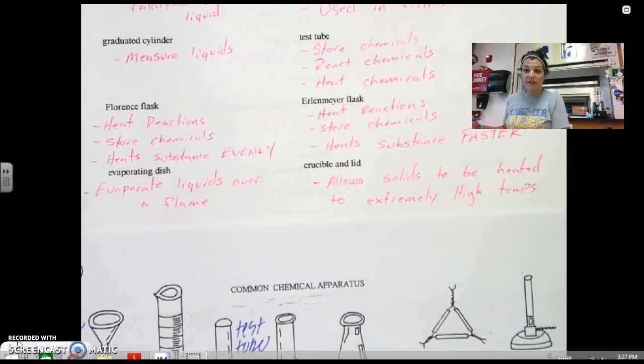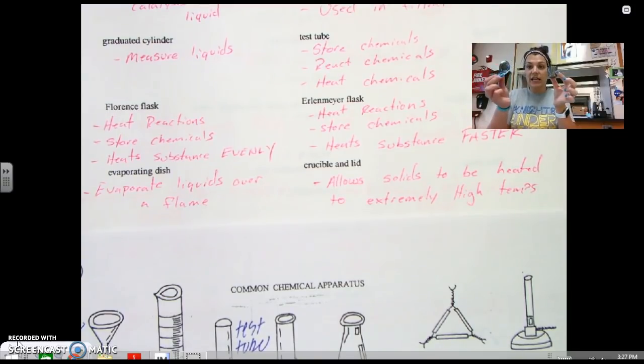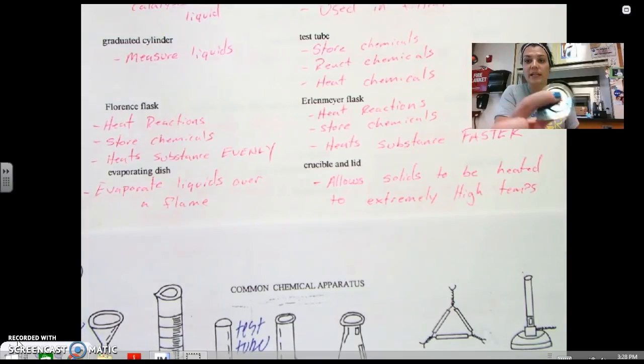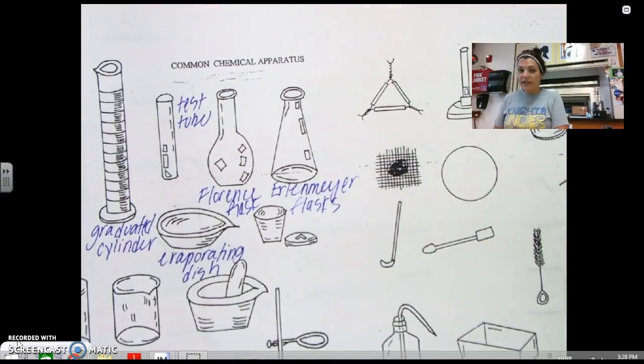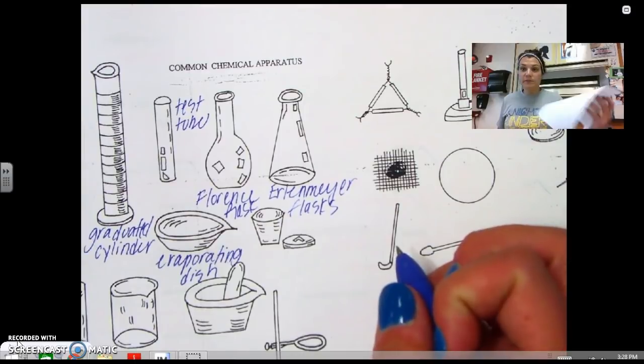Crucible and lid also allows us to do this as well. So go ahead and write down what the crucible and lid does. It allows solids to be heated to extremely high temperatures. So this is our crucible and this is our lid. So we use these two things because we can put solids in here to evaporate off water if the solid has water on it. And most of the time when we use a crucible, we have to put the lid to the side a little bit like this to allow that water to escape the crucible. So this guy right here is our crucible and lid. And I always spell crucible wrong.